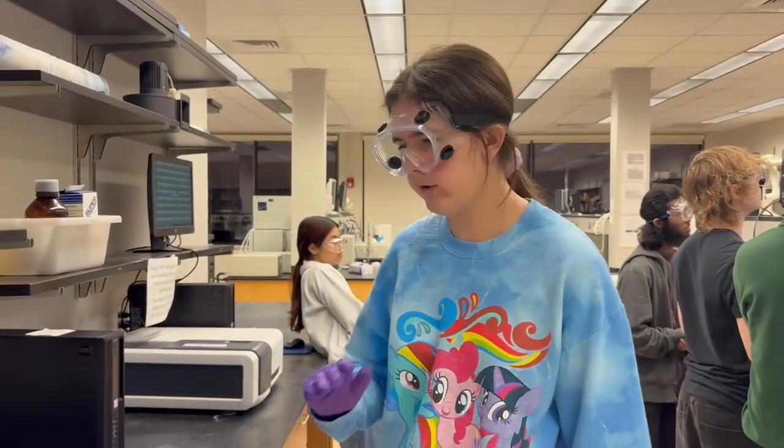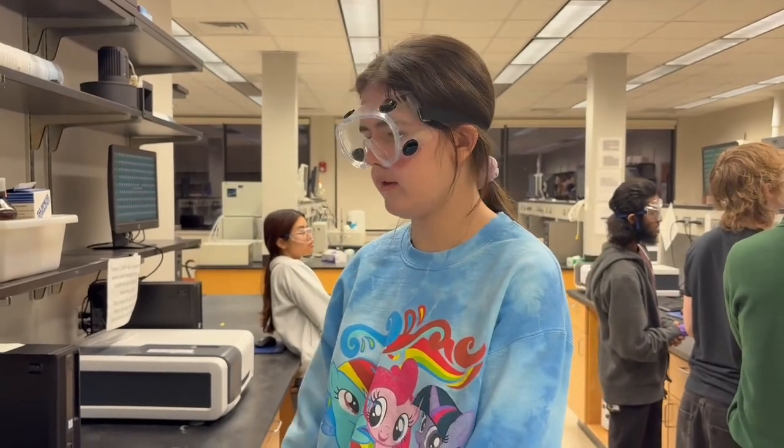Once you get done with your cuvettes and all your wipes, make sure you take all your cuvettes back and throw away all your wipes so we do not make a mess around the area.